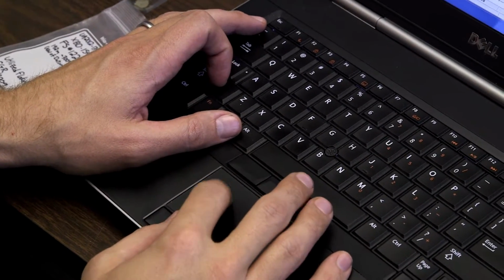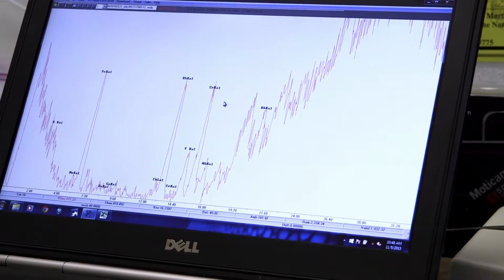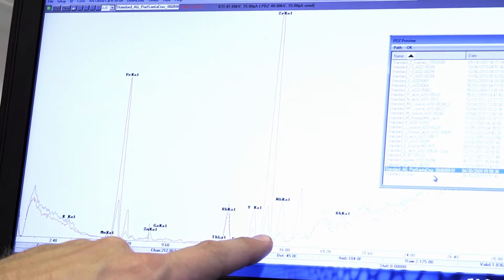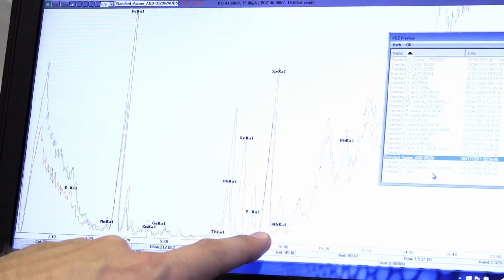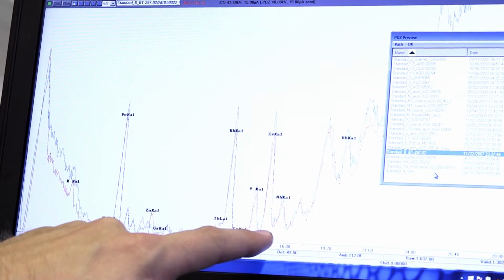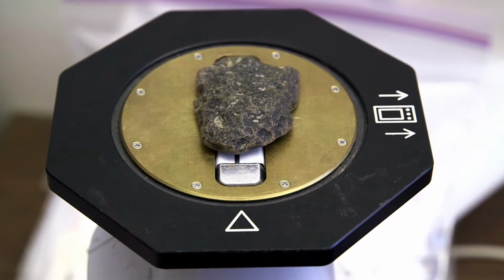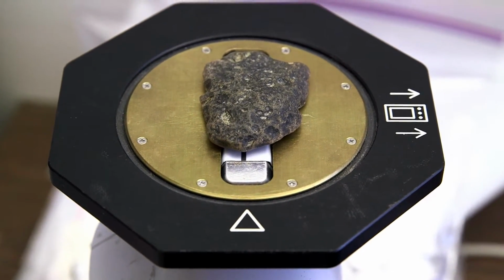For materials like obsidian and rhyolite, we can compare the spectrum peaks and the parts per million abundances to known geologic sources. This allows us to track the movement of obsidian and rhyolite artifacts from their original geological location to archaeological sites. These movements of materials tell us about a movement of people and trade and exchange patterns and connectedness of groups through time.